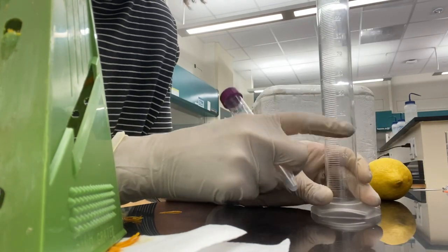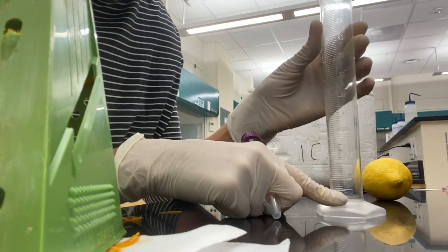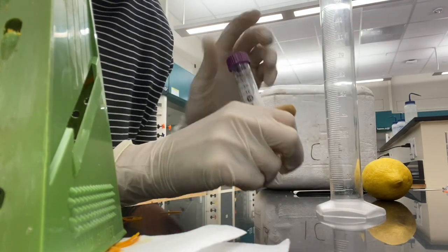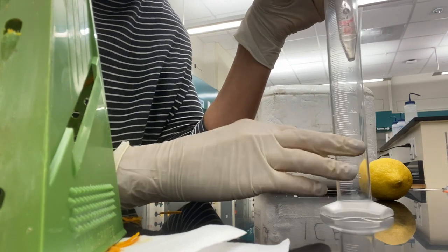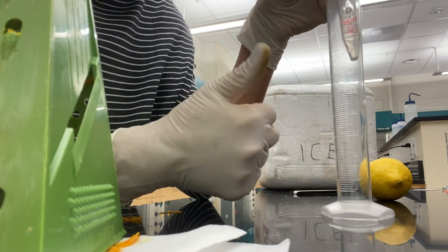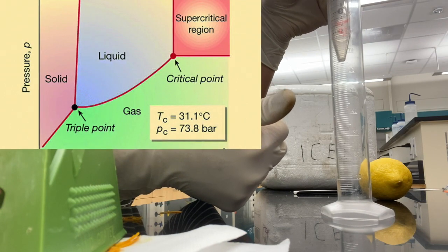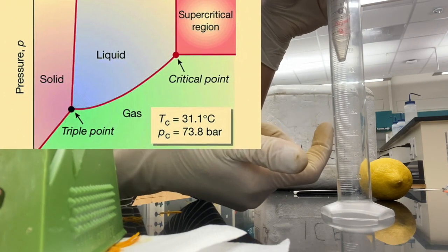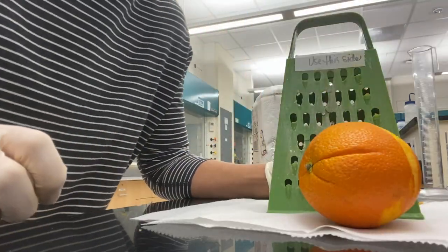We're going to use a plastic graduated cylinder, fill it with some warm to hot water, and insert our centrifuge tube into this grad cylinder. Hopefully we can not only increase that temperature of the dry ice but also increase that pressure even more to access the supercritical CO2.